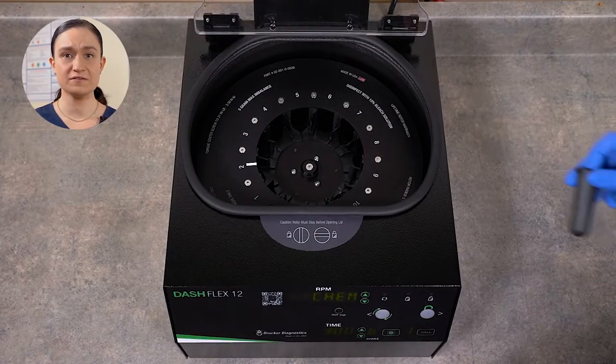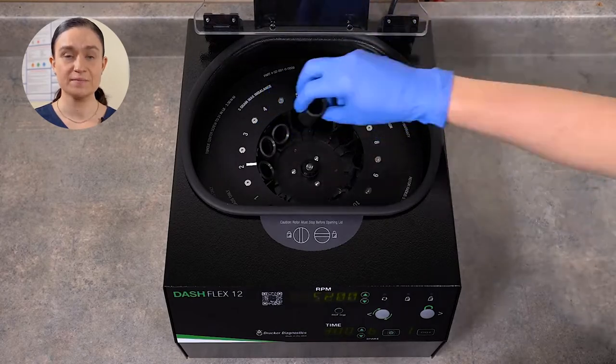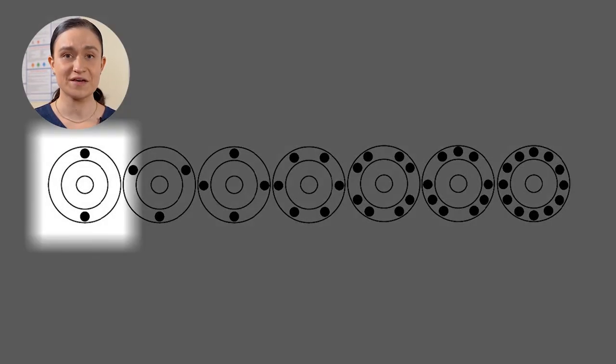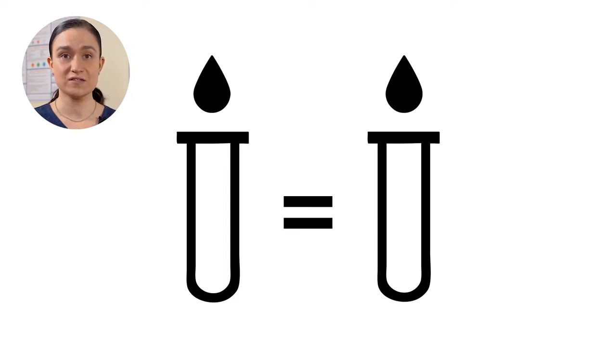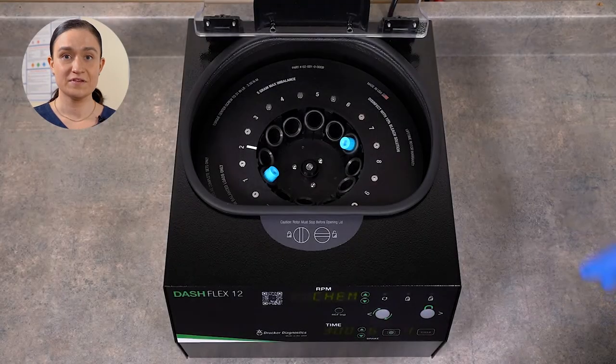Step 1: Make sure that all 12 tube holders are properly seated in the Dash Flex 12 rotor. They do not snap into place, but should be seated one per slot in the rotor. Step 2: Load your samples. When loading your samples, opposing tube holders must be of equal weight, as shown in the diagram on your screen. If you're loading two tubes, put them across from each other. If it's three, make a triangle. Four, a square, and so on. If you're spinning an odd number of tubes, you'll need a counterbalance tube — an identical tube filled with an equivalent volume of water from the tube across from it, so it's roughly the same weight as your filled tube.